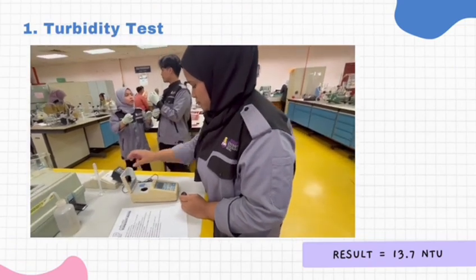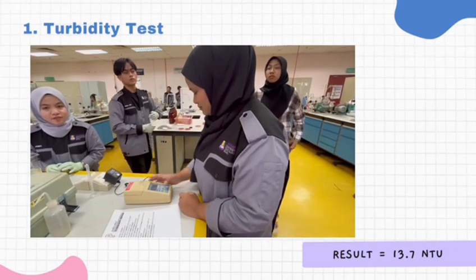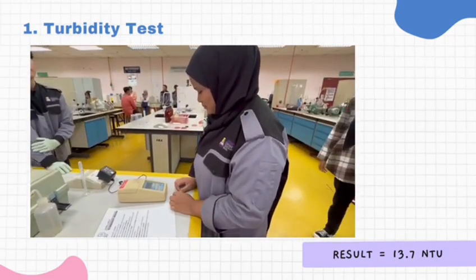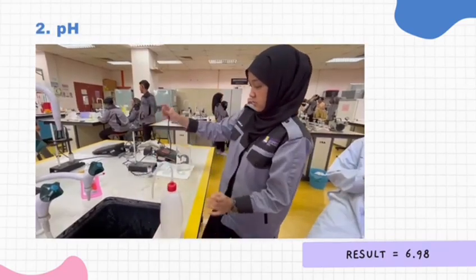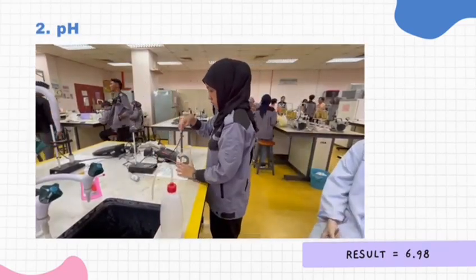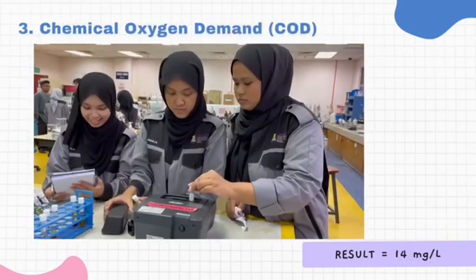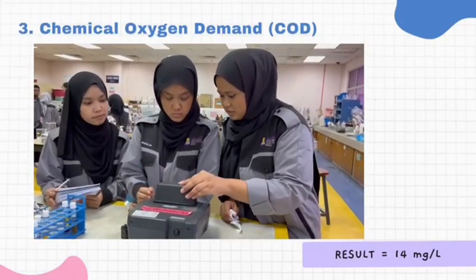First, the result for turbidity test is 13.7 NTU. Second, the result for pH test is 6.98. Lastly, the result for chemical oxygen demand, COD, is 14 mg per liter.